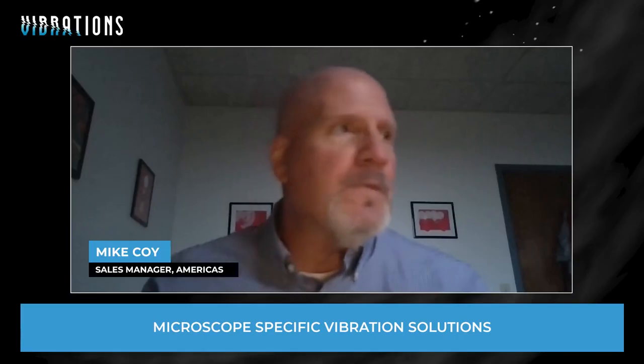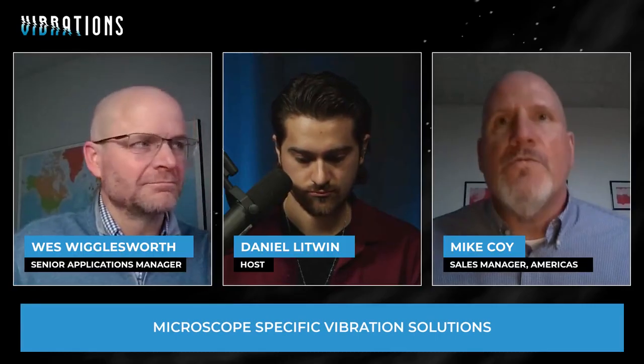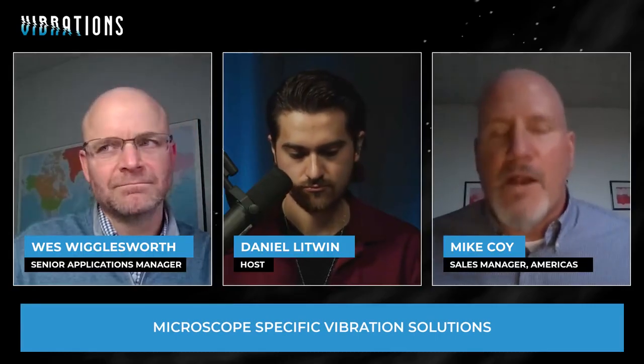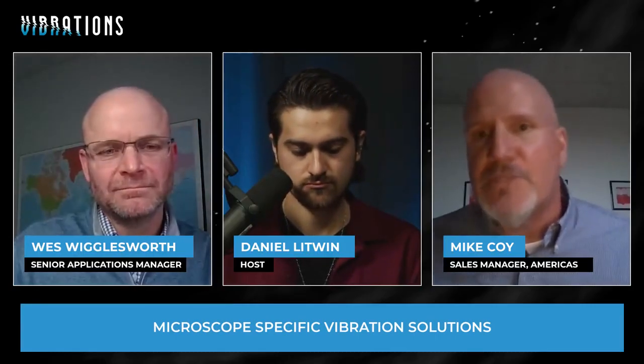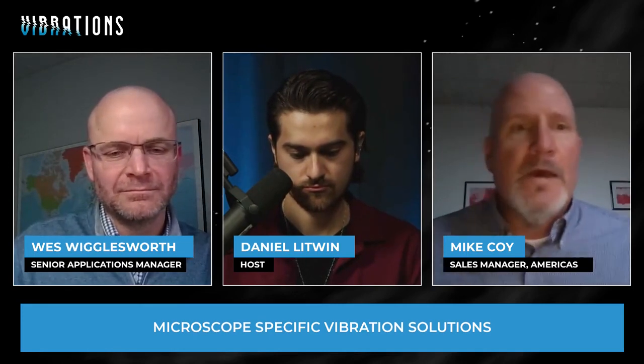Wes said something a few minutes ago, right? Trying to match our footprint to the instrument. A lot of these microscopes are in rooms, like I said, designed for them. They also have ancillary equipment. There might be vacuum pumps. There might be X-ray systems. There might be electronics for cameras. We have to make sure that our solution does not add space to that instrument. So that's a very, very big deal.